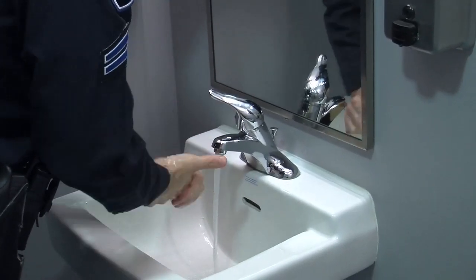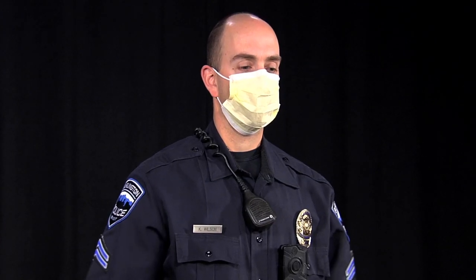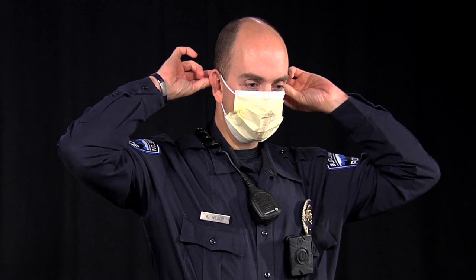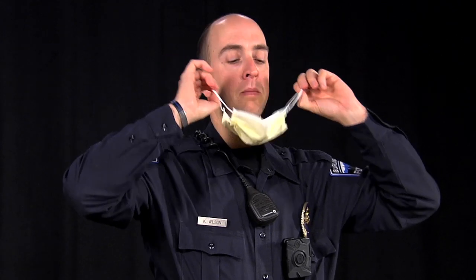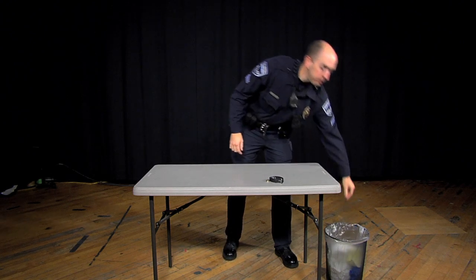Wash your hands. To remove your face mask, grasp the elastics of the mask from behind your ears and carefully remove your mask without touching the front of it, and discard. You are now done doffing your PPE.